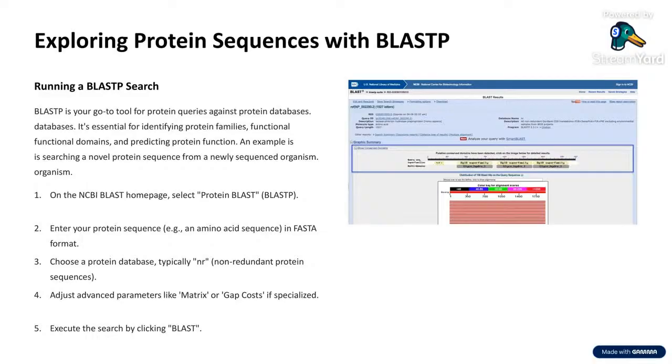Specifically, how many positions in the alignment are exact matches. It is the percentage of identical DNA, RNA, or amino acid residues between our query and the subject sequence. A higher percentage identity suggests a closer evolutionary or functional relationship.